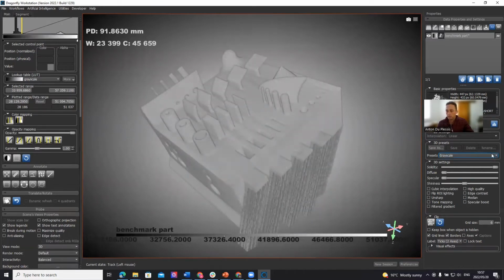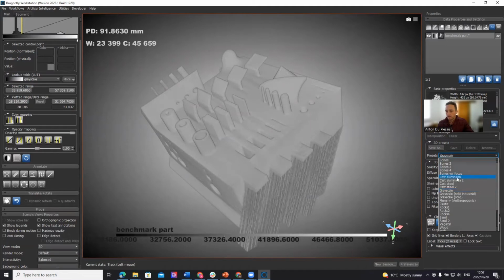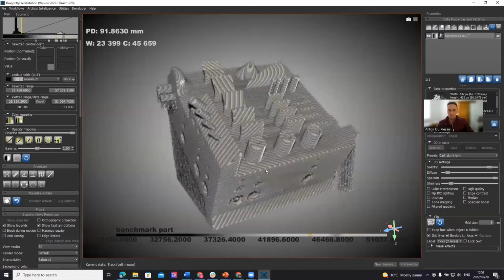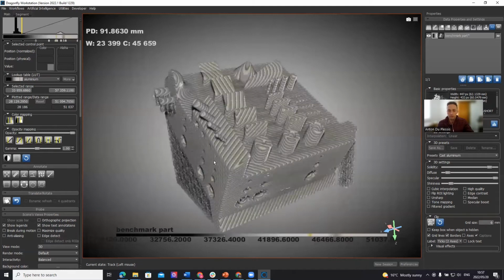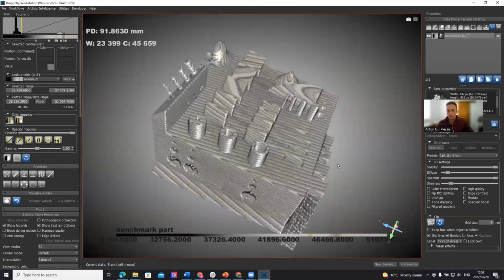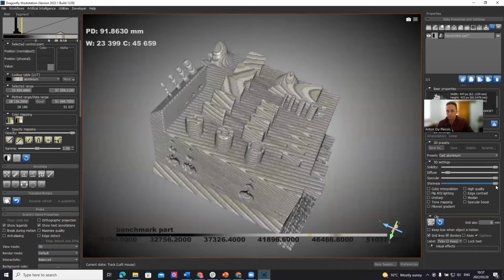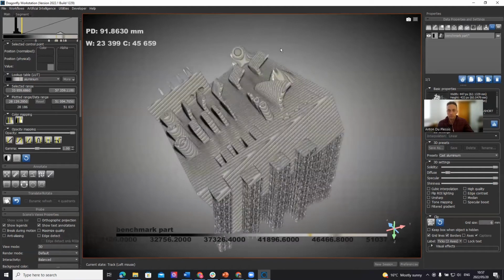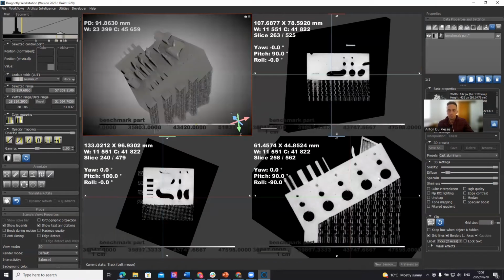The default grayscale render is not so great. I like to use the aluminium preset. It's quite a nice default set of render parameters. You can also modify that slightly to make it more shiny. What we're going to do here is not play with the default rendering. We're going to make a thickness mesh.